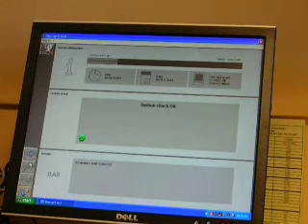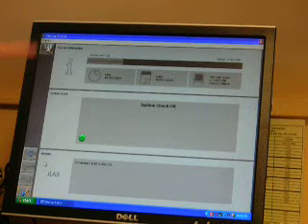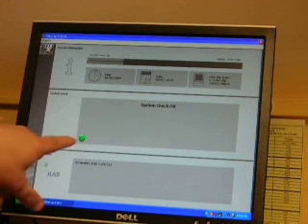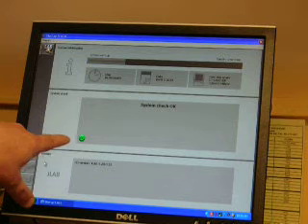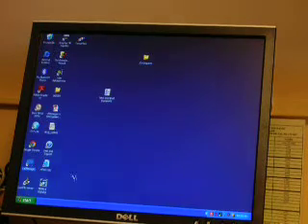Okay, this is Michael White, and I'm going to go over the calibration of the IOS system. When you turn the system on, it's the JLab, and this screen will come up. When this green button here says OK, you can exit out and start entering the ambient conditions.